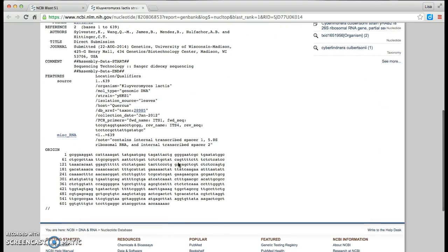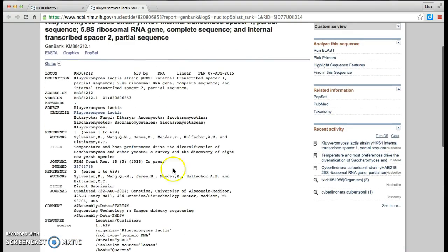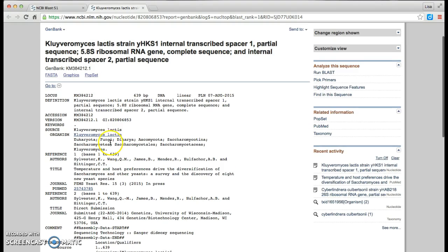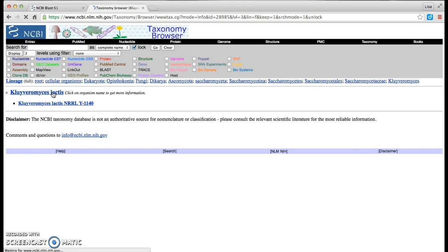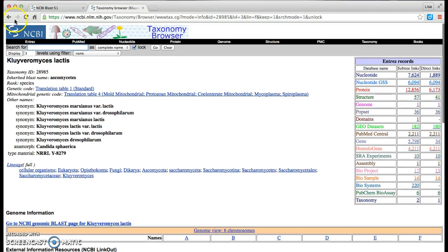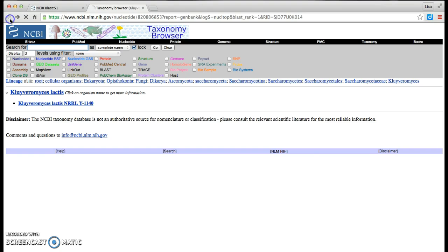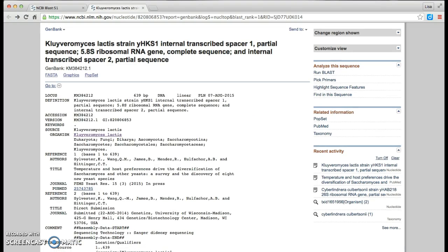If I go towards the bottom, I still have the DNA makeup. I have a report that has been sent in from Dr. Hittinger and his colleagues. I can choose the organism and find out more information about it. For instance, various synonyms and a full lineage.